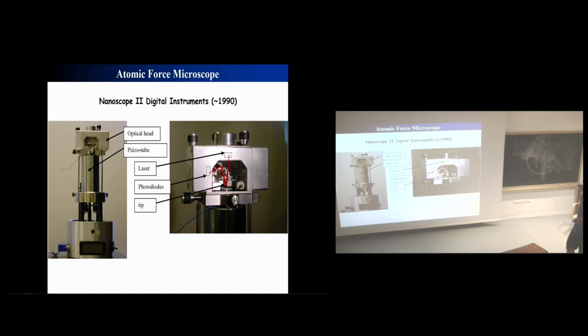You have two screws to focus the laser on the cantilever and one screw to properly tune the position of your photodiode on the laser.